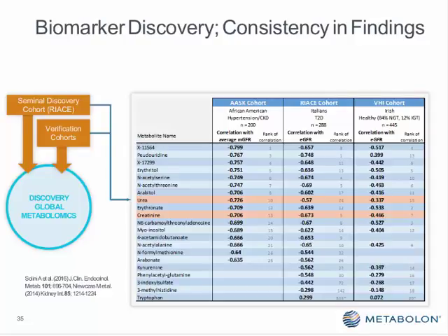Some of the things to take note of in this data: one is, regardless of the clinical setting, we do see the same top markers. The metabolites are listed in the first column on the left, and the rank of correlation is on the right side of each of the 3 columns. You can see that these are all highly ranked and correlated with mGFR or eGFR.